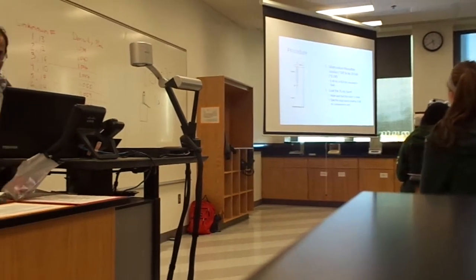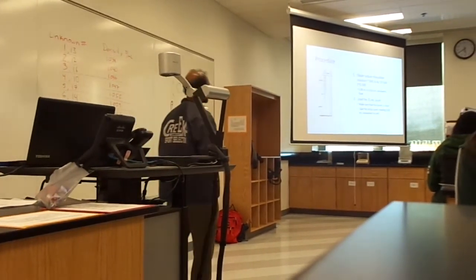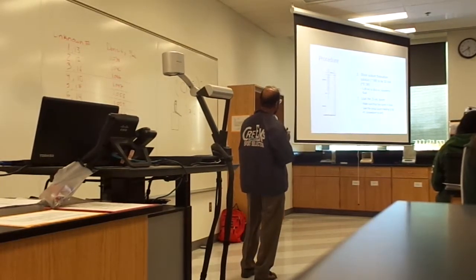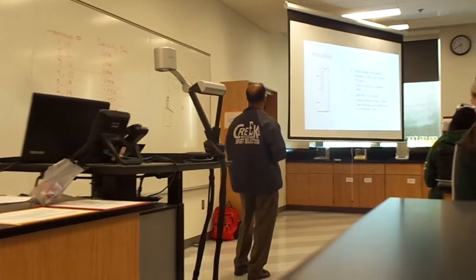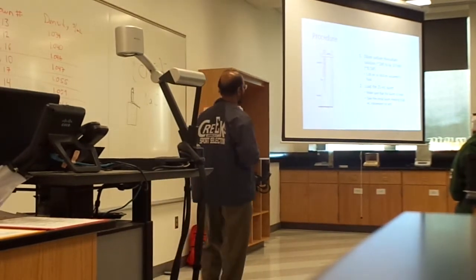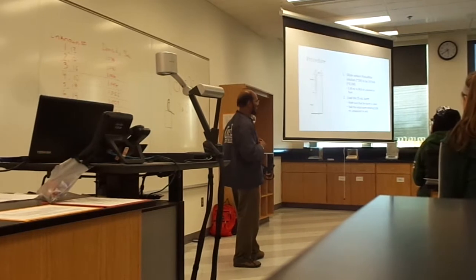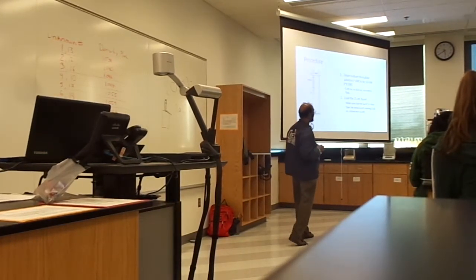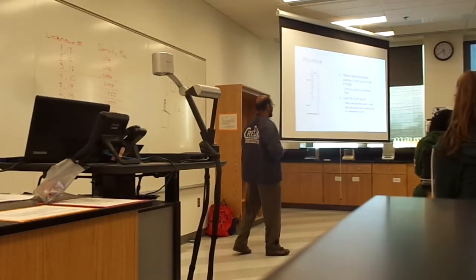Now the procedure. The first step in this experiment is to prepare the burette and make it ready for the titration. So what do you have in the burette in this experiment? If you read the procedure, what will you have in the burette here? Sodium thiosulfate, right?